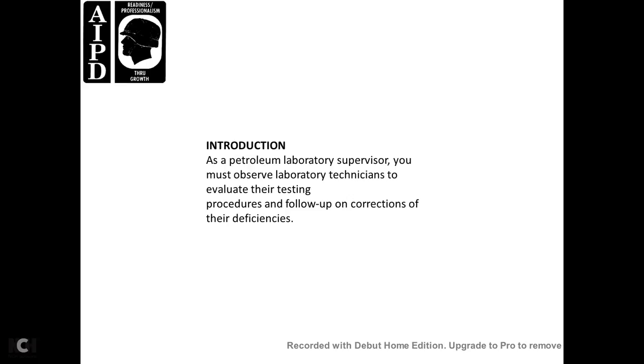Lesson 3, simulated petroleum products. Critical task 101-523-3400. Introduction. As a petroleum laboratory supervisor, you must observe the laboratory technicians to evaluate their testing procedure, following up on the corrections and the deficiencies.